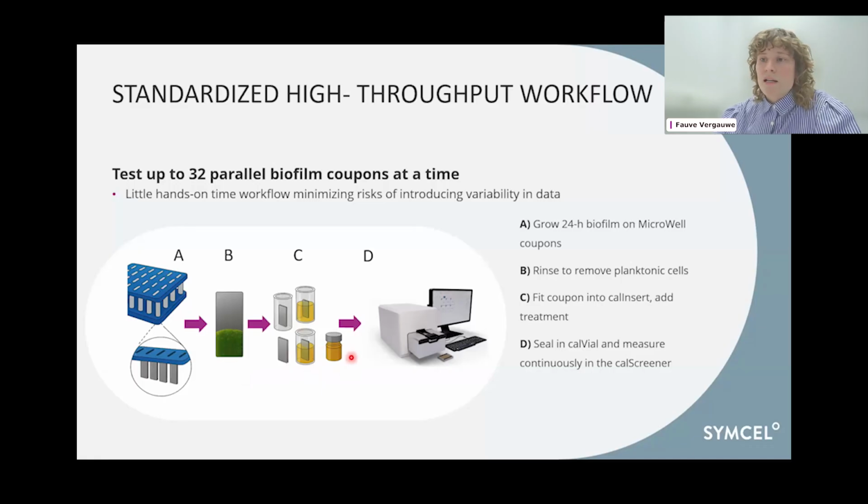So once the titanium vials are sealed, you can simply measure the metabolic activity that's going on there in the calScreener.